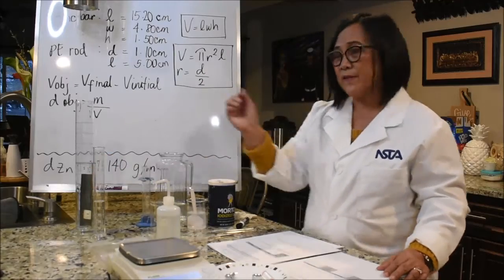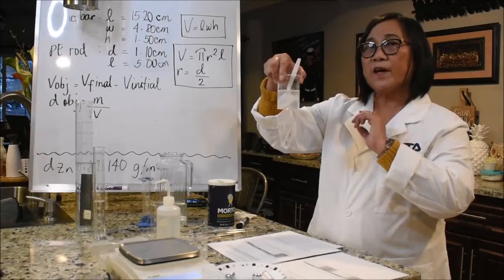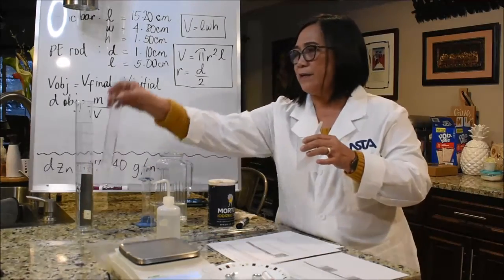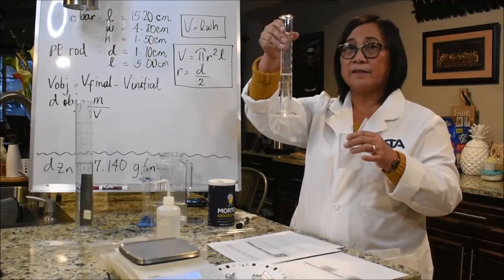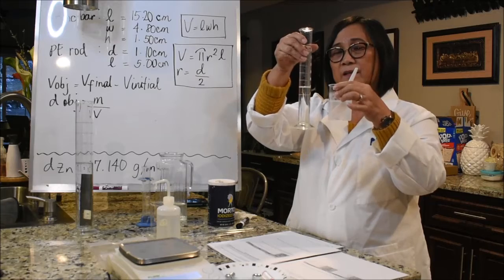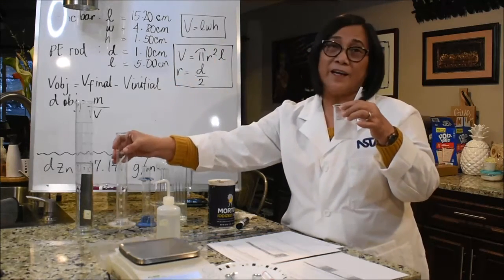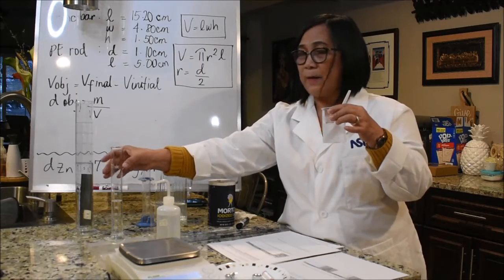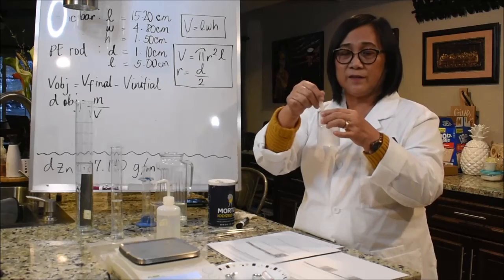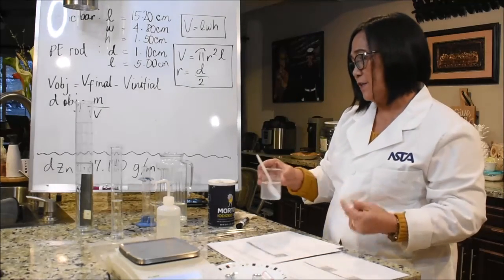Now, we will do the same this time with a saturated salt solution, which I already prepared earlier. And note the difference, guys. See, this is tap water and it is clear. Our salt solution, which is saturated, is translucent. Why? Because I have added more than enough salt than tap water is able to dissolve, and that is what we call a saturated solution. I have added salt until no more dissolves in water.